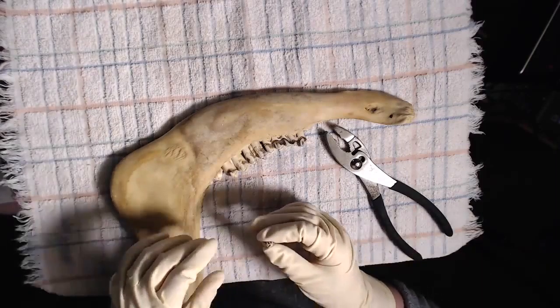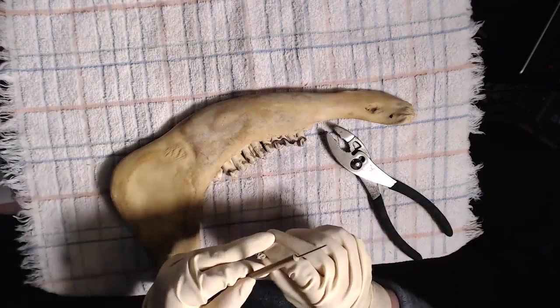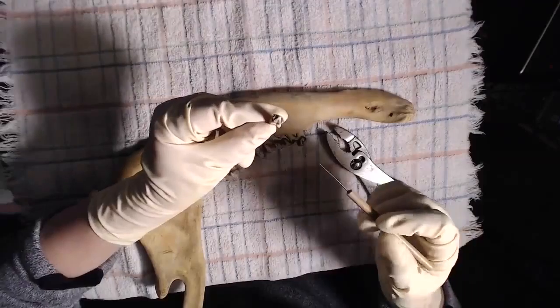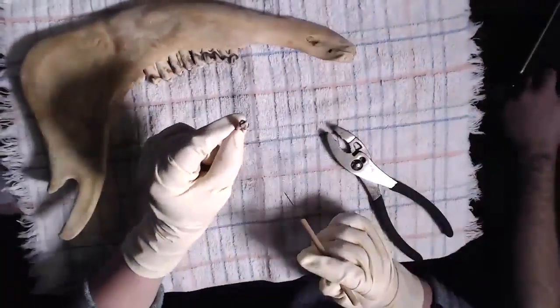All right, so hopefully you'll at least have one tooth pulled out. I'm going to use this tiny one here. So we're just going to look at the parts of the tooth that Dalton talked about in his presentation.